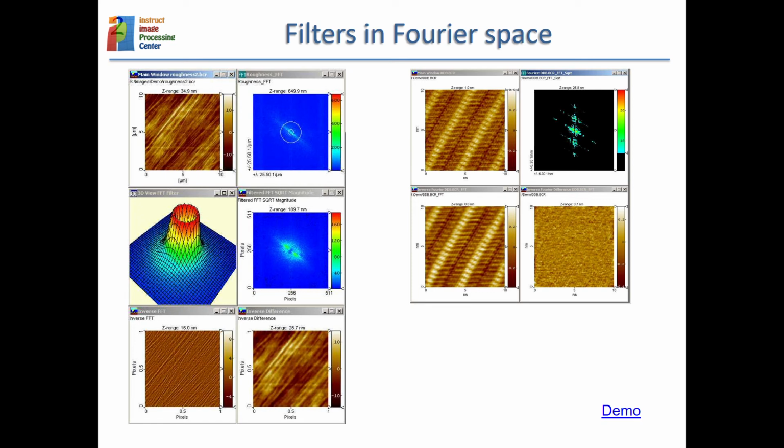So for instance, here we have a couple of examples. In the first column, we have an image and its Fourier transform. Here we are representing again just the amplitudes. We see that we require a lot of energy from very low frequency components, and then there are some components along this direction, and the remaining directions don't have almost any energy. And we understand now why this direction, because it is the direction of the waves. So we can see here a kind of wave propagating in this direction, so that is why we need all these energies here.